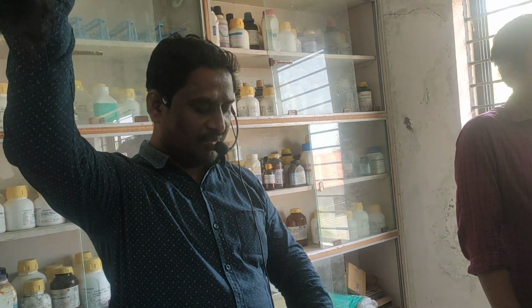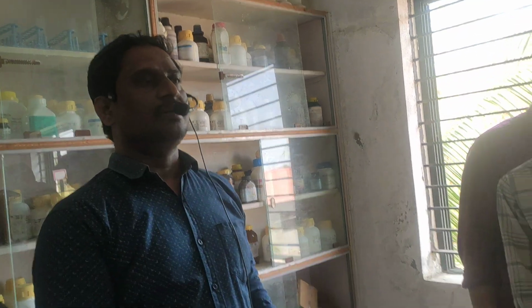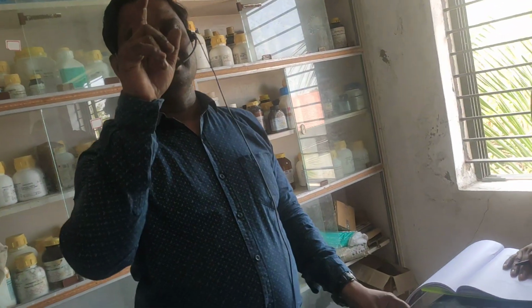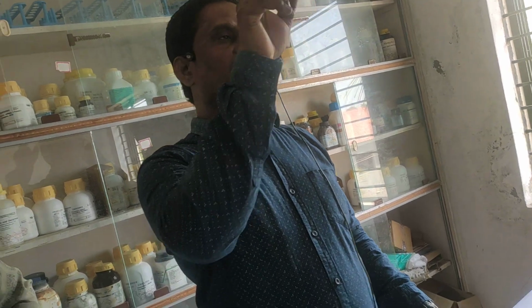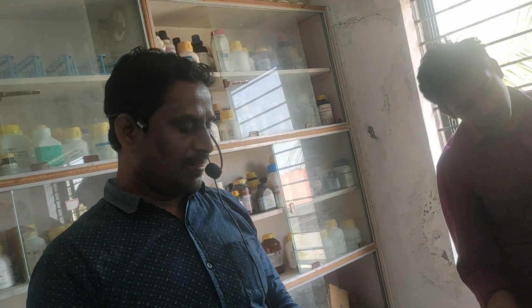Now we got group 5. Now what do we have to do? We have to analyze the fifth group. All of you see the fifth group on the page. Analysis of fifth group. Now we want to check what type of cations are there in the fifth group. Ca2+ is there, Ba2+ is there, Sr2+ also is there. Correct or not? There are 3, and we have to identify which one is present. Now see all of you, analysis of fifth group, test for Ca2+.